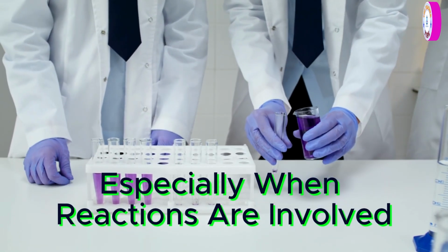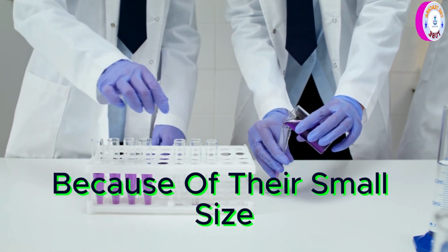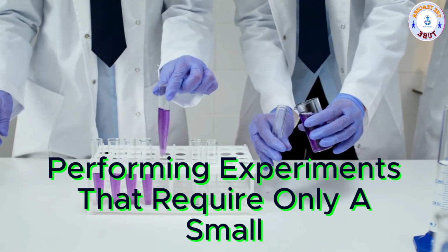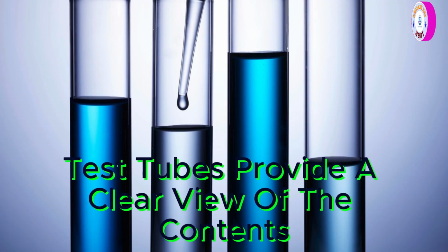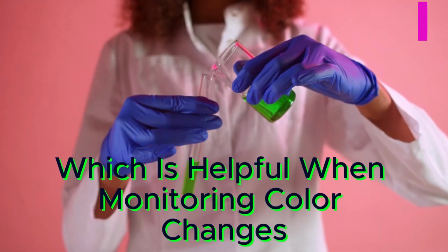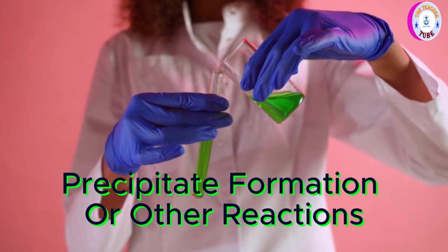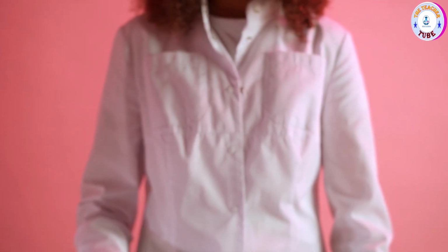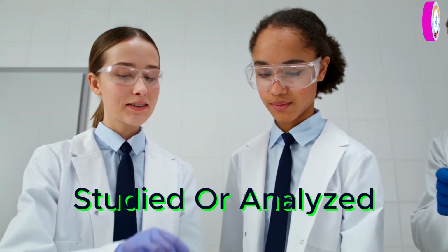reactions are involved. 3. Carrying out small-scale reactions. Because of their small size, test tubes are ideal for performing experiments that require only a small volume of material. 4. Observation. Test tubes provide a clear view of the contents, which is helpful when monitoring color changes, precipitate formation, or other reactions. 5. Holding samples.